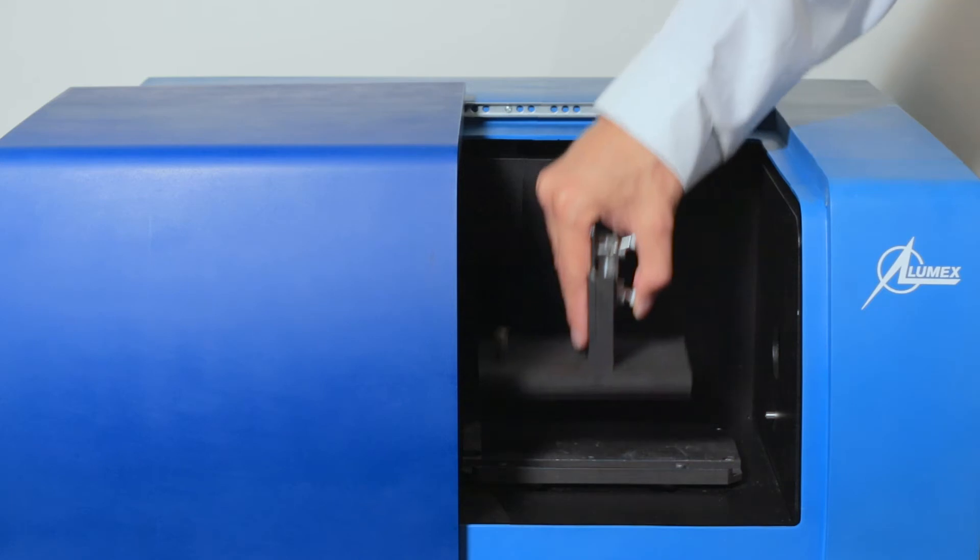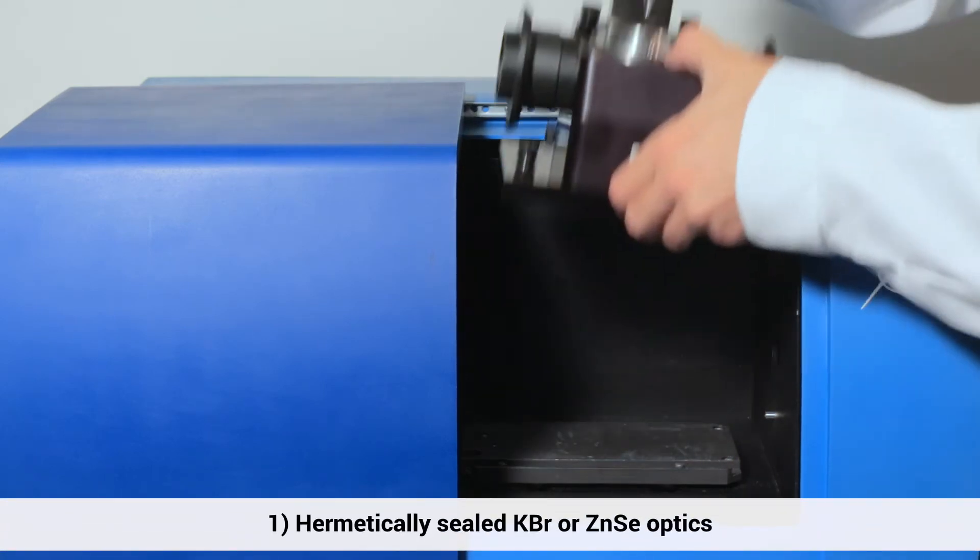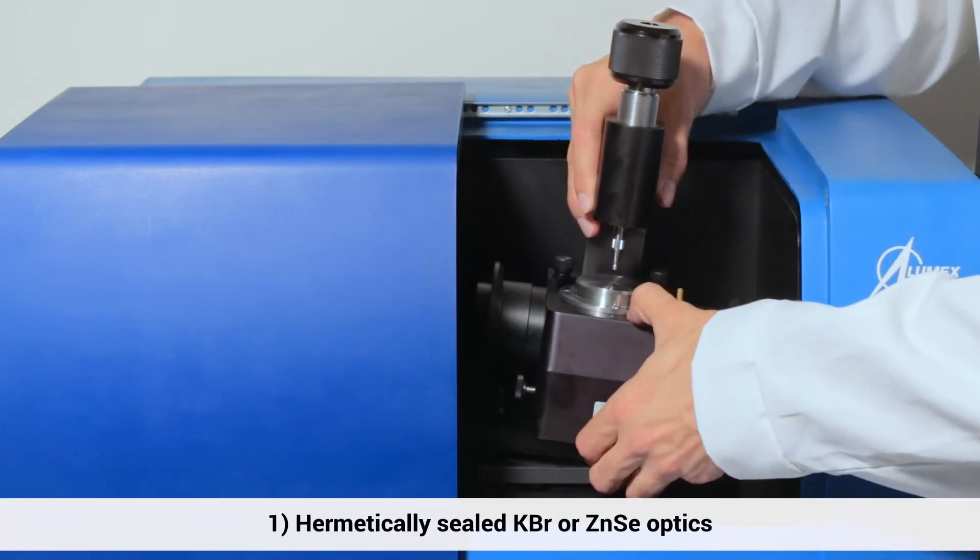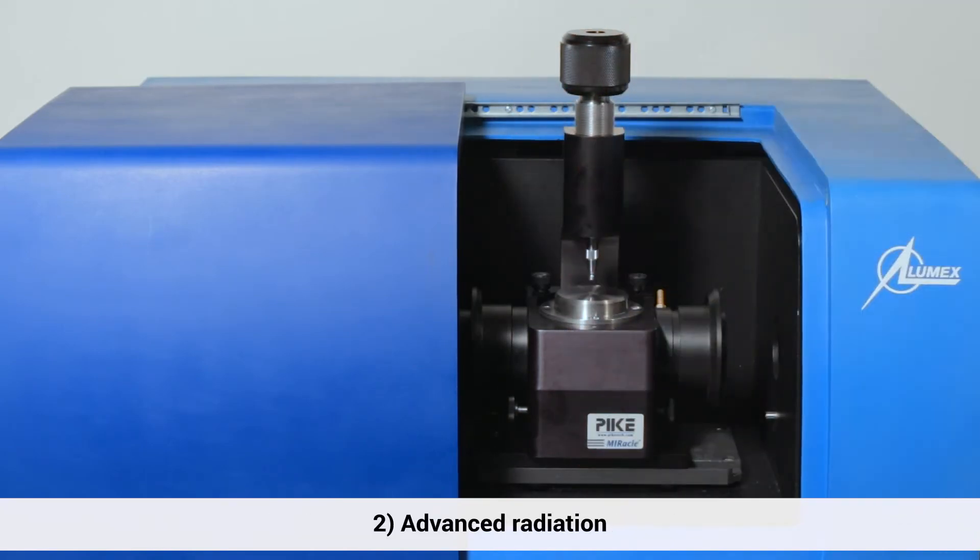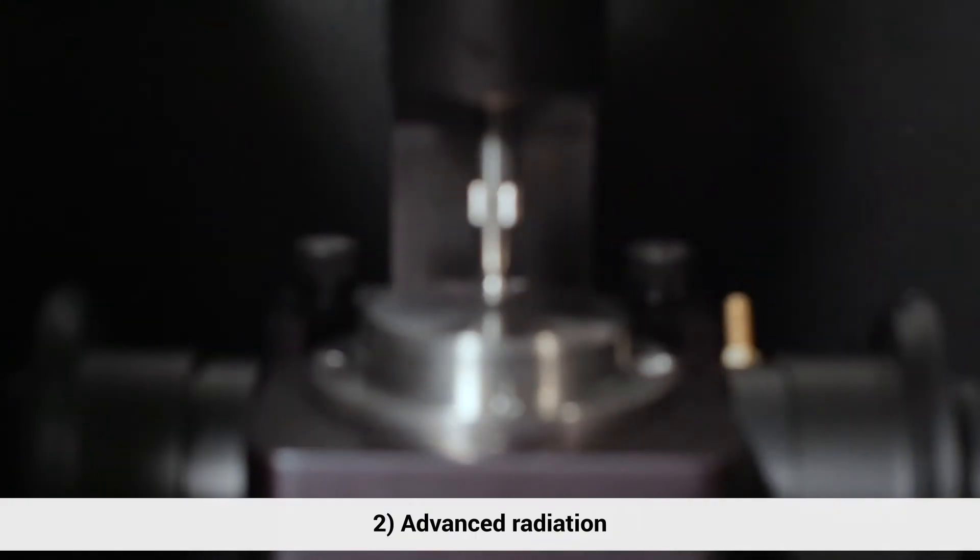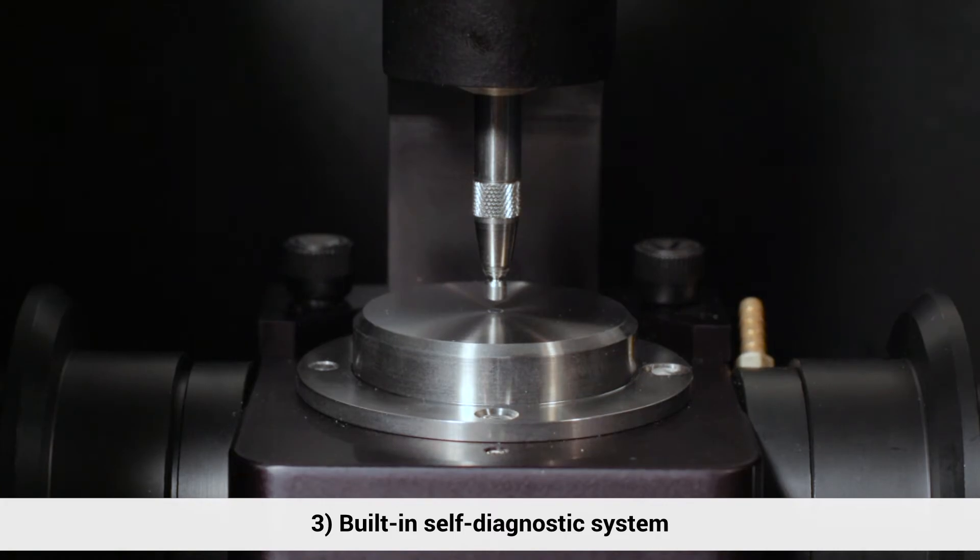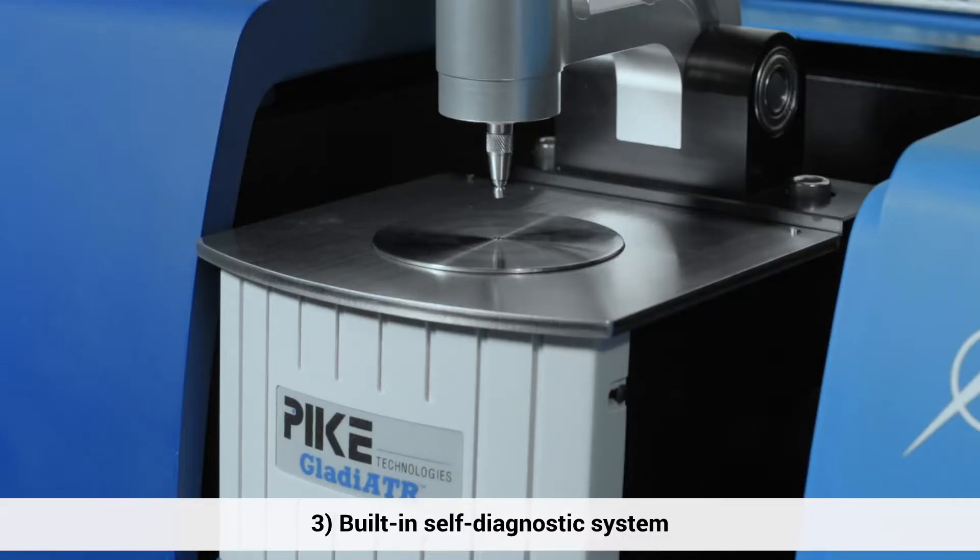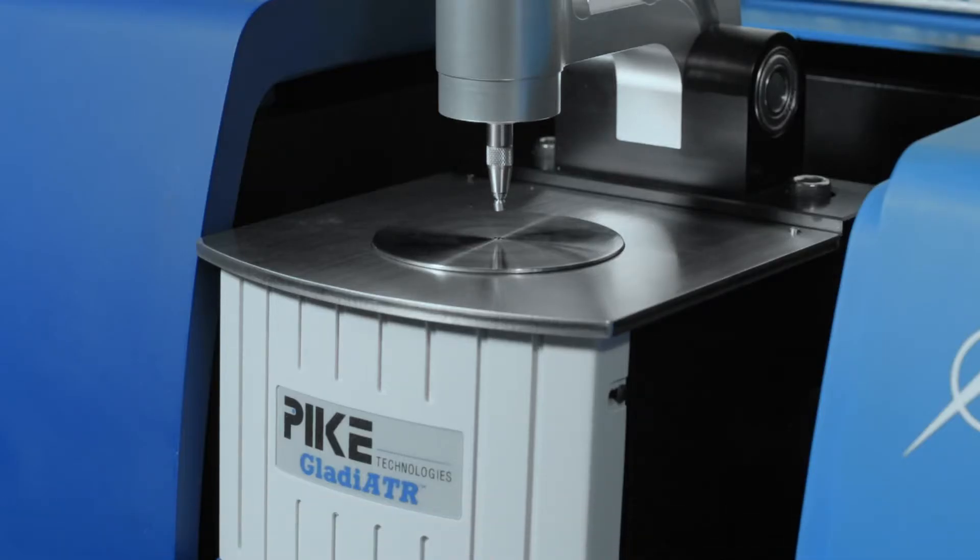Moreover, it is equipped with an advanced radiation source, hermetically sealed optics that protect the beam splitter from dust and moisture, and a built-in self-diagnostic system. All of these features will ensure the instrument operates at optimum conditions for an extended service life.